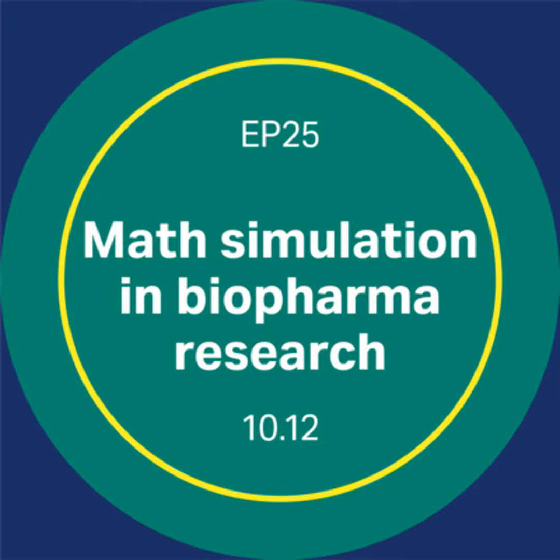With these new types of antibody variants, there's a number of closely related product-related impurities that are so similar to the drug molecule that the separation task is much more complicated. And this is where mechanistic modeling can provide a very efficient shortcut.